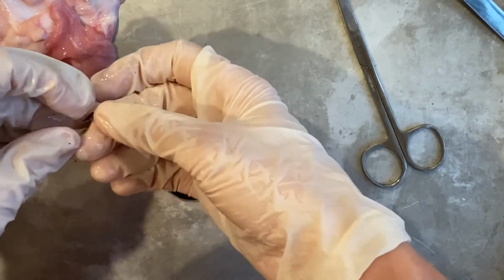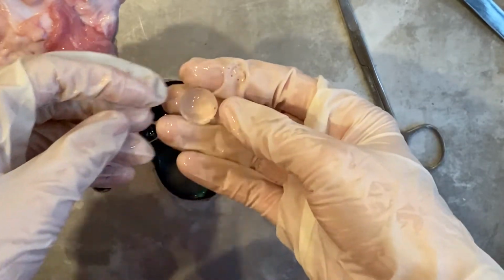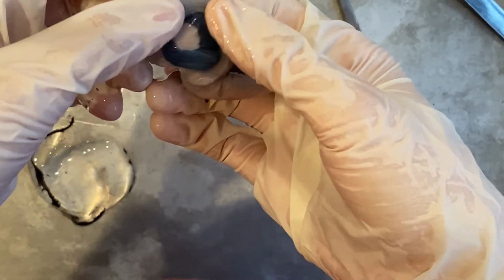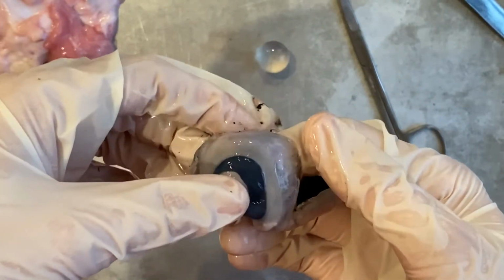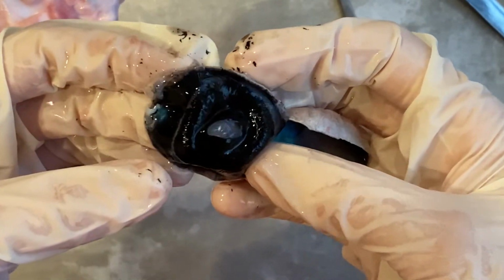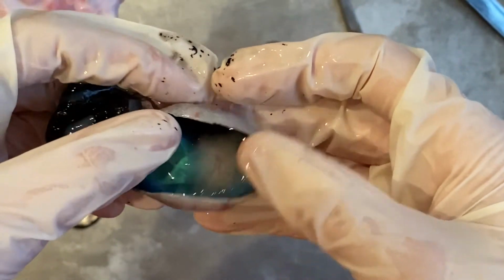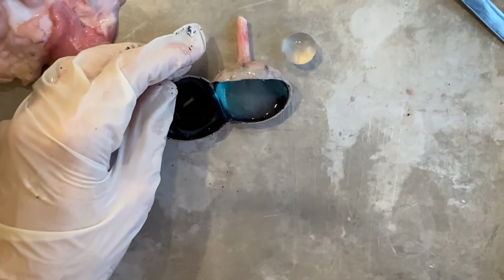Okay, so there's the lens. We have the lens. This is very round. So here is the iris inside that goes around where my finger is at in there. And so I guess we're gonna need to get in there and cut some of this stuff apart to maybe remove the iris. Still don't know where the ciliary bodies would be. And then we can maybe look for the retina.